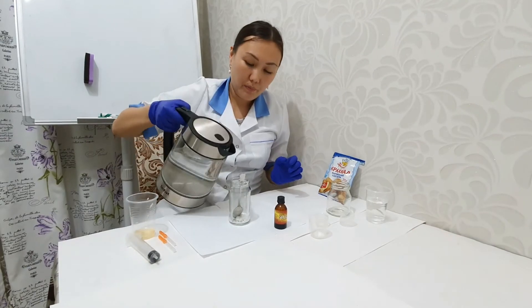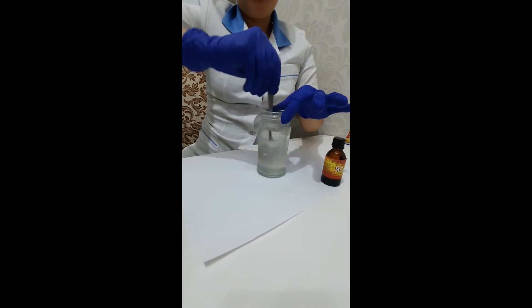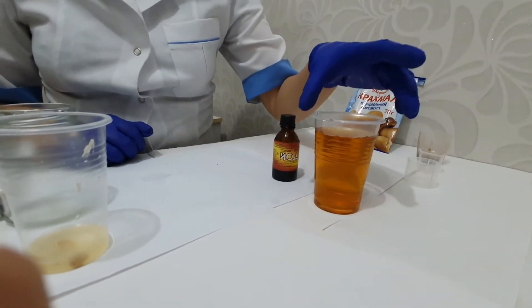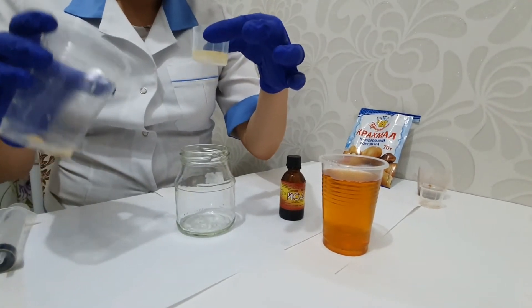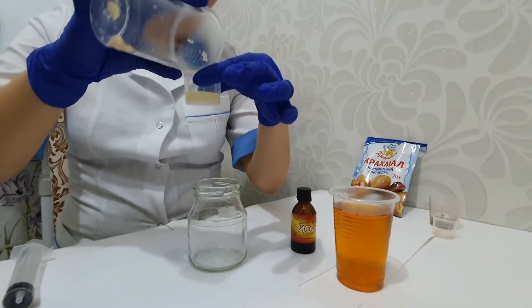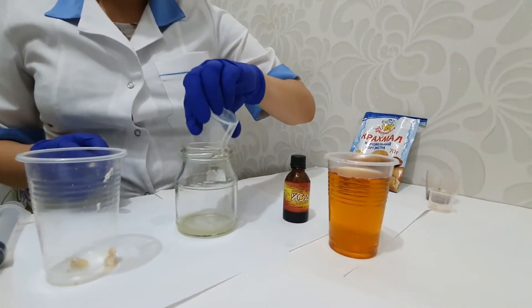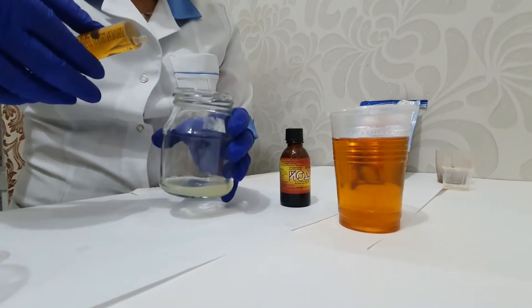I prepared a dilute solution of iodine, around 25 milliliters. Here you have a label showing 25 — I'm going to transfer it here, and then I'm going to titrate the lemon juice.